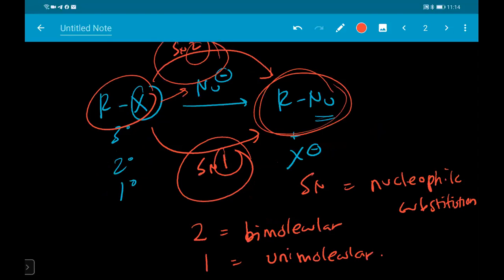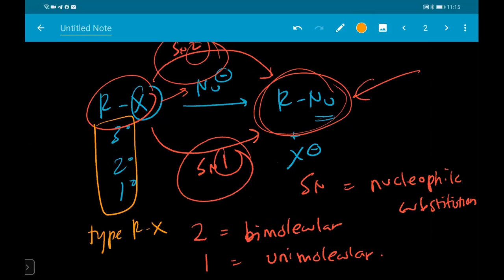That's why I'm highlighting earlier, we are not focusing on the destination. We are discussing the route that we are choosing. That's the idea of part C of the experiment. We want to study which route they prefer. It all depends on a few factors. Some of the factors are already listed below. First one is the type of alkyl halide. Ni macam jenis kereta tadi lah. Are you using kancil? Are you using BMW? This will be affecting your choice of jalan mana korang pilih tadi.